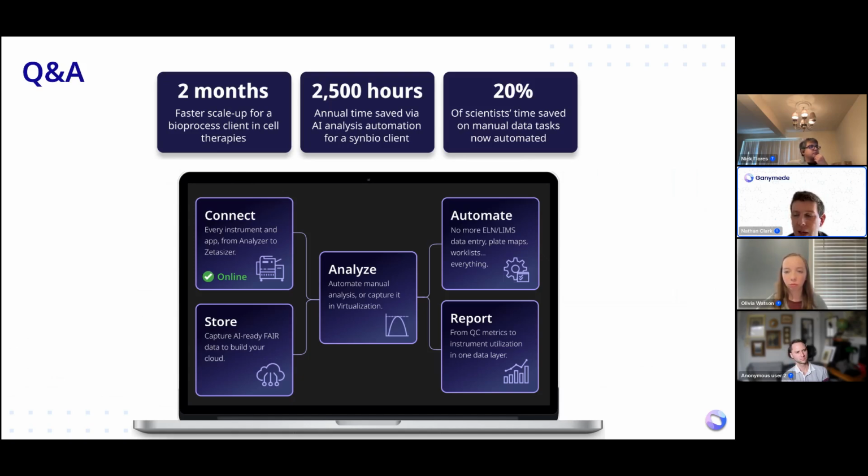And then on the second question, in terms of who this is for, it's really for people running the wet lab assays, whether that's a biotech company or in a diagnostics context or any sort of lab. That's where we want to be. So we will automate those workflows, go in and connect to the instruments, and then can deploy modular analysis. But our goal is to help the scientists. And so as long as they're scientists or technicians or people doing things with their hands, that's where we'll want to be. So a lot of that is biotech, but again, it could be anyone with a wet lab.